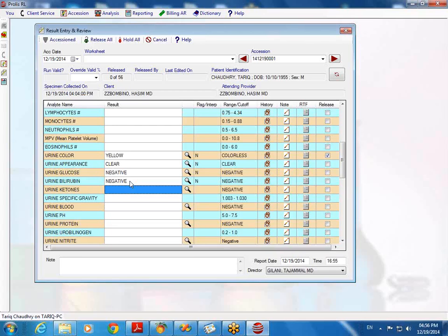This test, for example urine color, belongs to this accession, and this accession belongs to this patient. So you would have an accessioning ID for each test and the actual result for each test. And why you want to do this? Because, sorry, go ahead, Marguerite. No, you're probably going to ask the same thing.